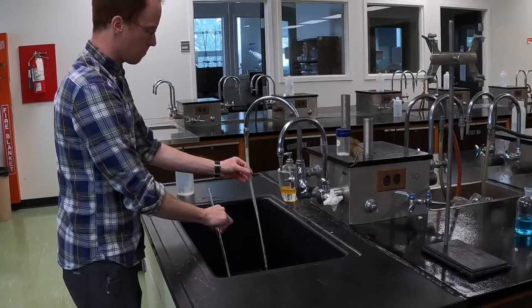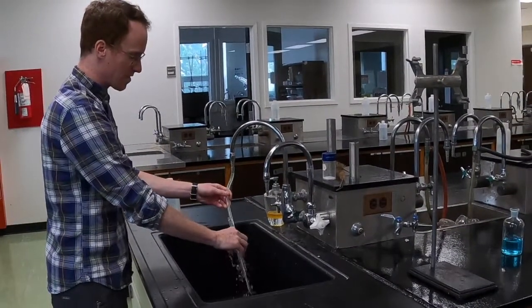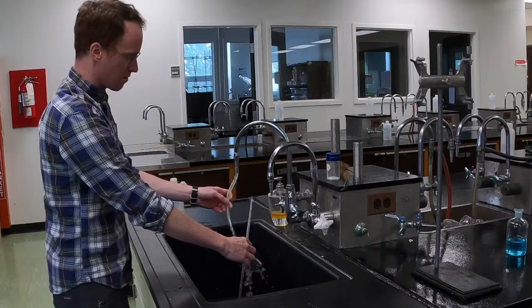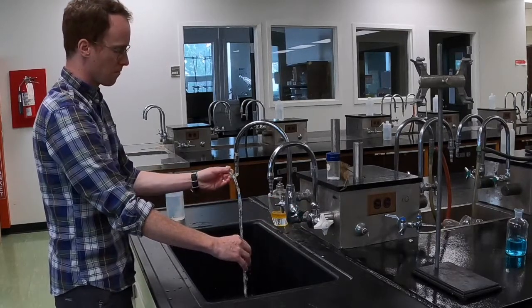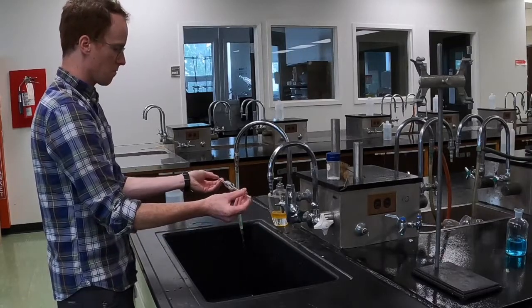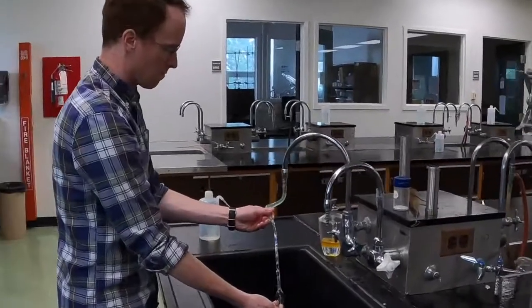Once you have your glassware removed from the storage bath and all of the detergent has been drained out of it, you need to bring it to a sink and rinse it inside and outside with at least 3 large portions of tap water, and more is okay. To rinse the inside, make sure you fill the glassware at least 1/3 to 1/2 full. Swirl the water around inside it, and then drain. Make sure that the water coats the entirety of the inside of the glassware.